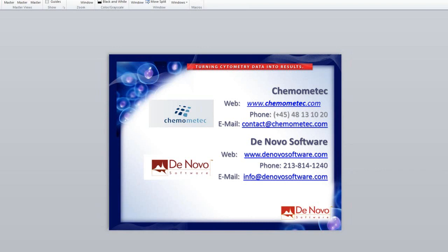No, I think it's very beautiful, everything, and that both you and we can do this gating from image to plots and from plot to image, and you have a very good way of treating multiple data samples. So the batch processing is really fantastic, and also the way of doing the analysis of the cell cycles, getting the G1, G2, and so on coefficients, and seeing whether there is aneuploidy and stuff like that.